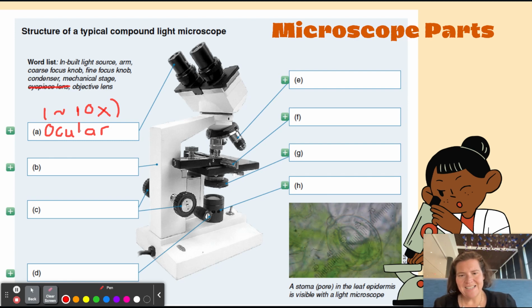Let me just go in the order that they have prescribed here. This next part is called the arm. And I also want you guys to know what these things do. So please just listen for what it's doing and jot these notes down underneath here somewhere. I just can't write all of that out at once on this particular video. So the arm, and I'll just cross that off as we get to it.